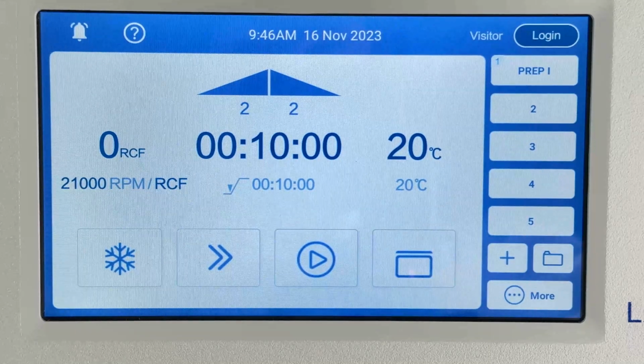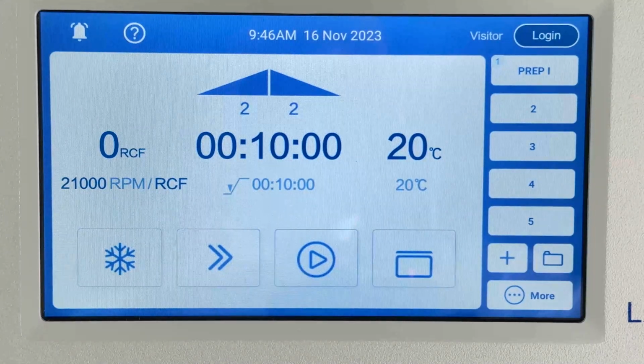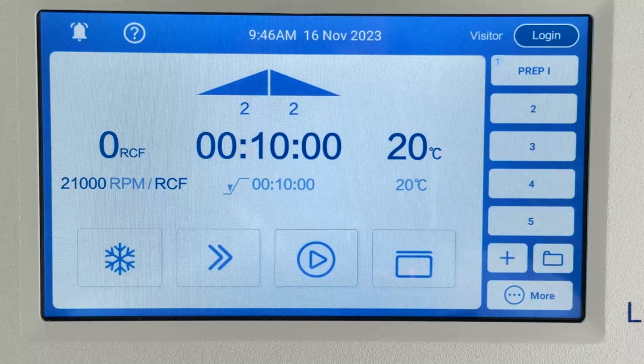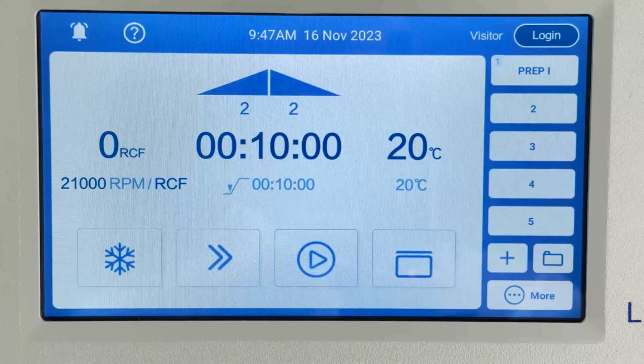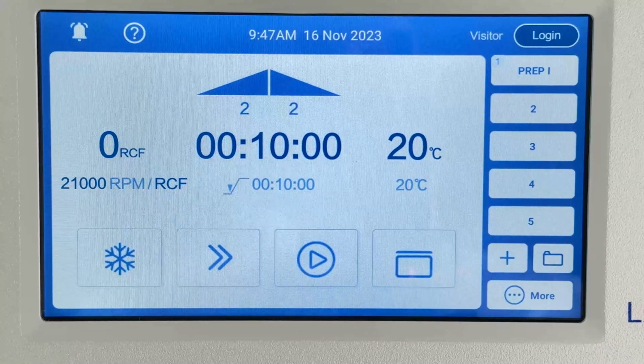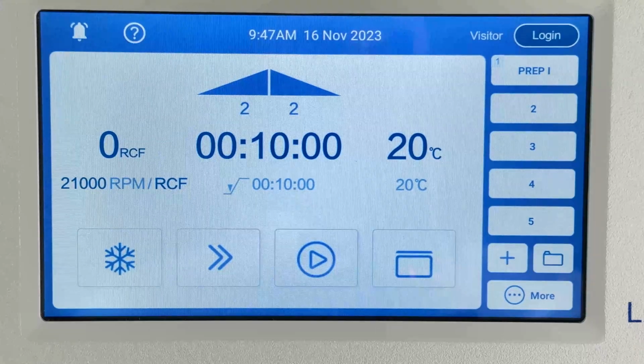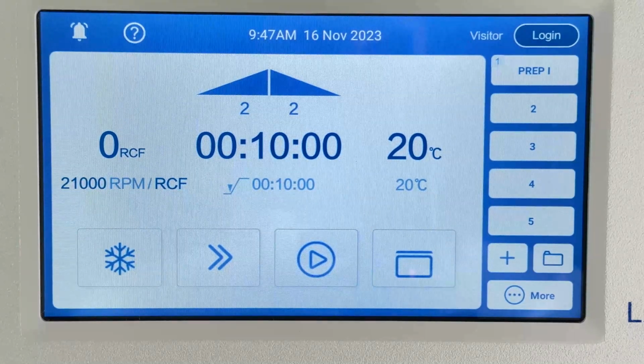You then, on the bottom row, you've got your pre-cool, your pulse, which is you hold that down and it will spin, ideally for bringing liquids that are on the side wall of a microtube down to the bottom. You've got your play button, which is obviously how you start and also then stop your run. And then at the end, you've got your open lid.